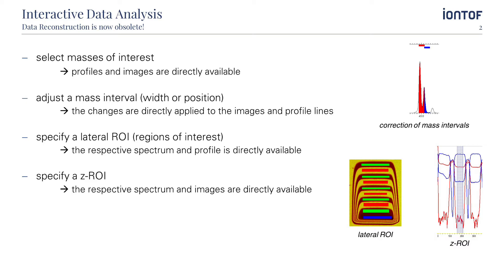The same holds true for regions of interest. If you would like to have a deeper insight into your data, you might want to see the TOF-SIMS spectra or profiles only from a limited region. After you have defined the lateral ROI or z-ROI, the corresponding spectra are directly available without time-consuming data reconstruction.